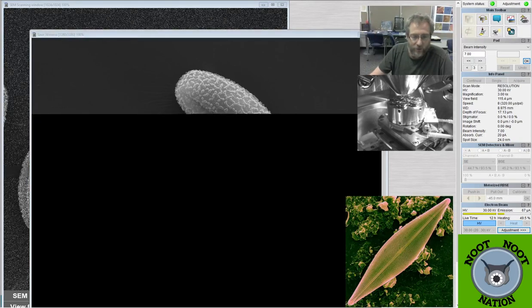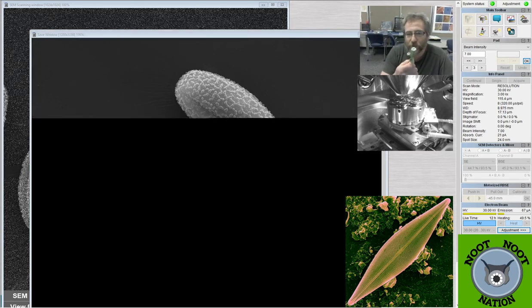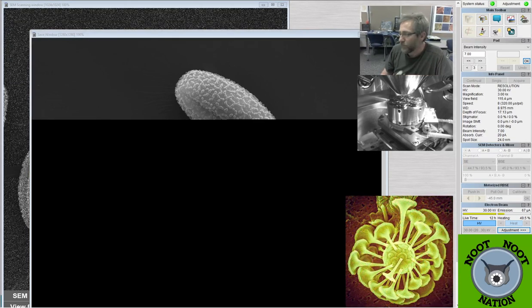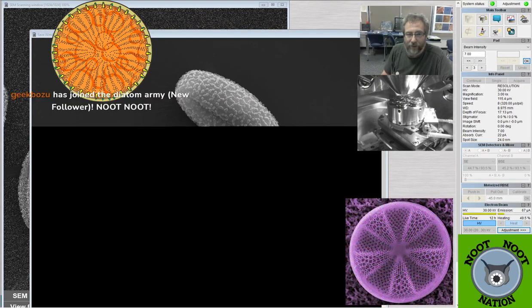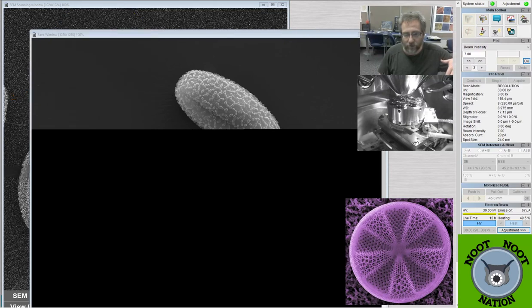The question that Andrevon asked was what the sample prep is like. So I went out and collected the flowers from this morning. I just took a pair of tweezers and ripped the flower parts off. I put them onto the SEM stubs, used some carbon tape, and just stuck them on there. Then I put them in the sputter coater, which puts a gold coating over the surface, and then stuffed them in the SEM.